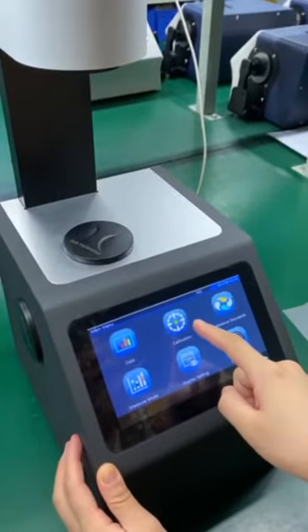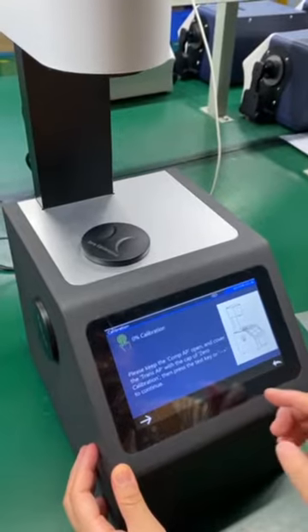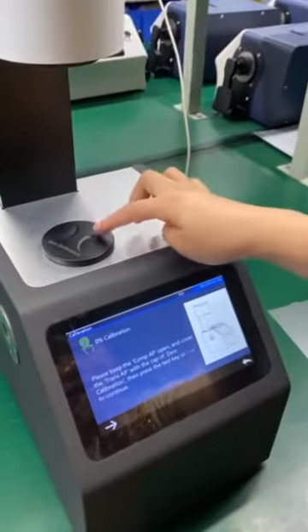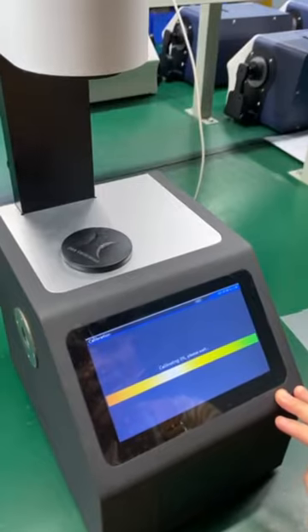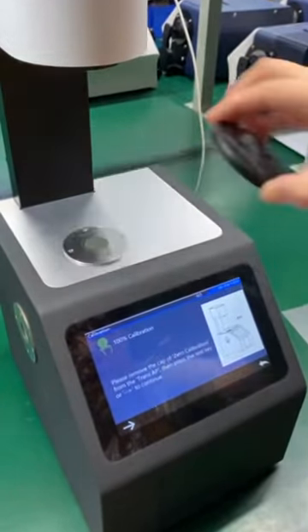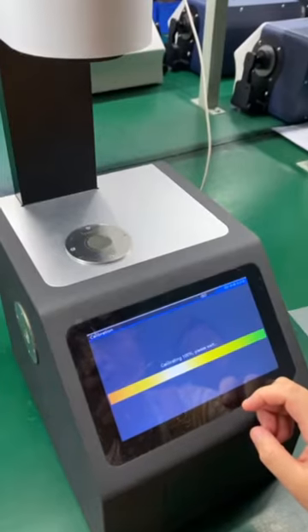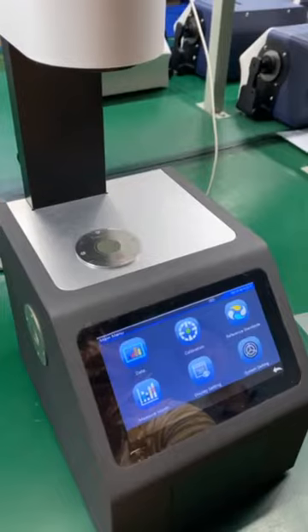When we choose one standard, we need to do the calibration first. We should keep the compensation aperture open and cover the zero calibration. Continue. Now we do 0% calibration, and then remove the zero calibration here. Continue, and we do the 100% calibration. Okay, now we can measure the sample.